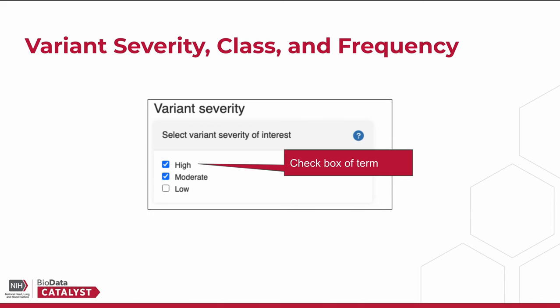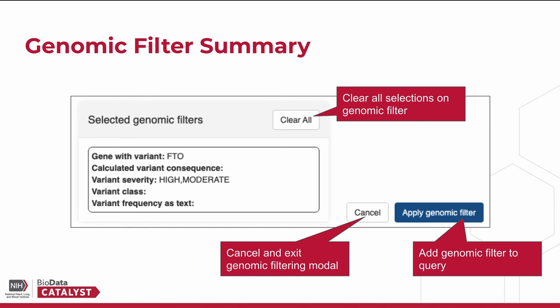To select categories from each of these fields, simply check the box next to the term of interest. As you can see in this example, we have selected high and moderate variant severity. The last field of the genomic filtering modal displays a summary of the genomic filter that was built. In this example, we can see that we have selected the FTO gene variant and filtered to high and moderate severity variants.